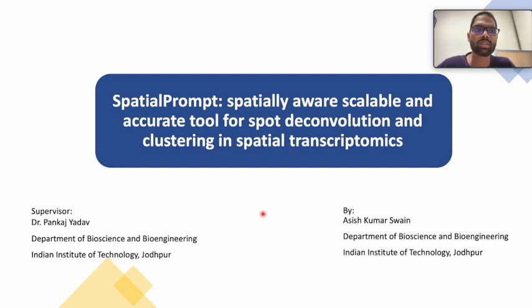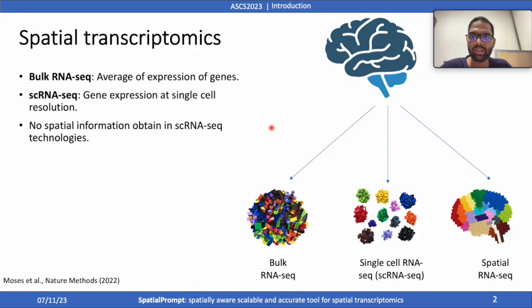The research I am going to present today is the tool we developed recently for spot deconvolution and clustering in spatial transcriptomics. So before we dive into the usability of this tool, let's first understand what spatial transcriptomics is. In transcriptomics, there are several levels of resolution.